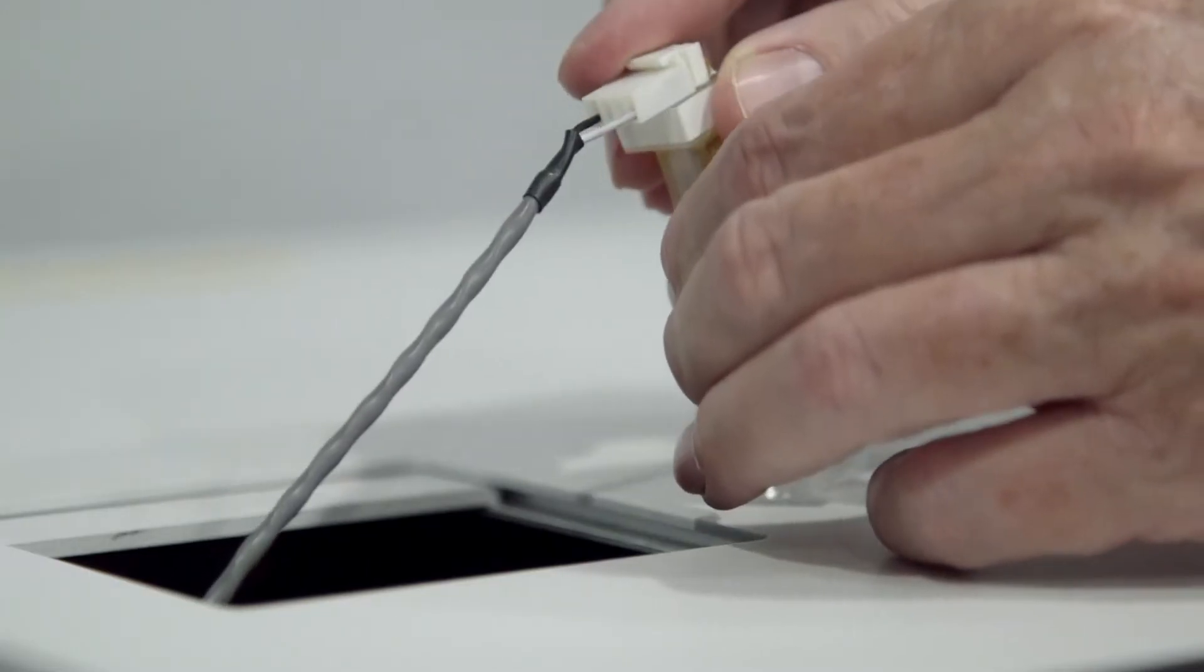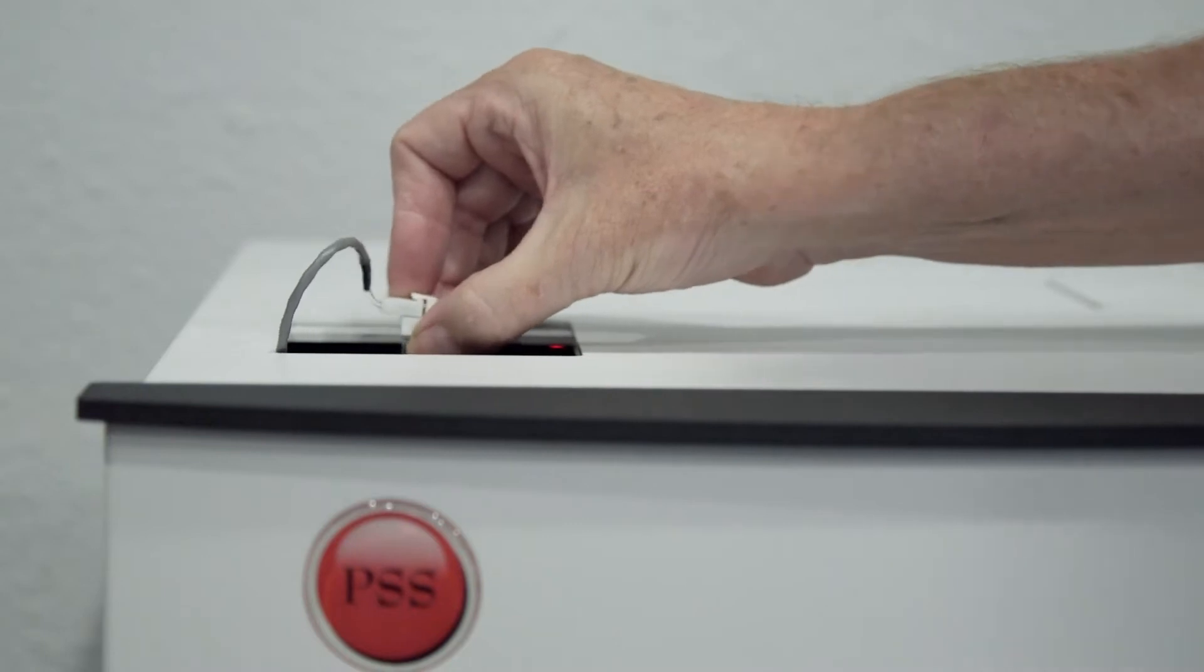By selecting the optimum laser, detector, fluidics, and accessories, the NICOP DLS system is built to match your samples and application, providing high sensitivity, high resolution size, and zeta potential results.